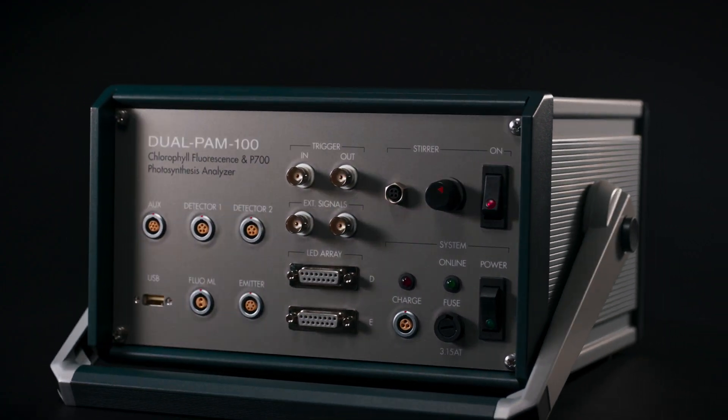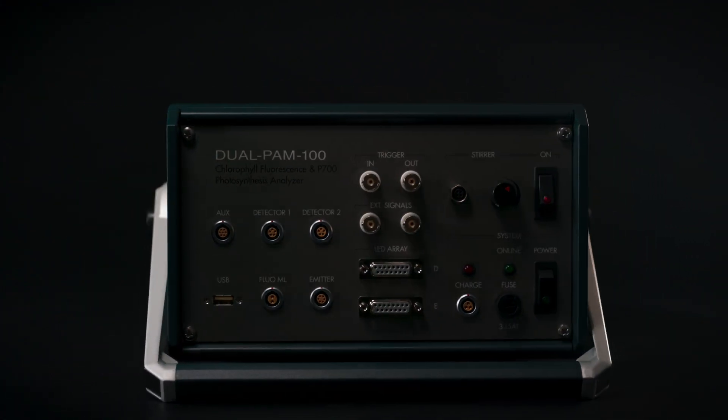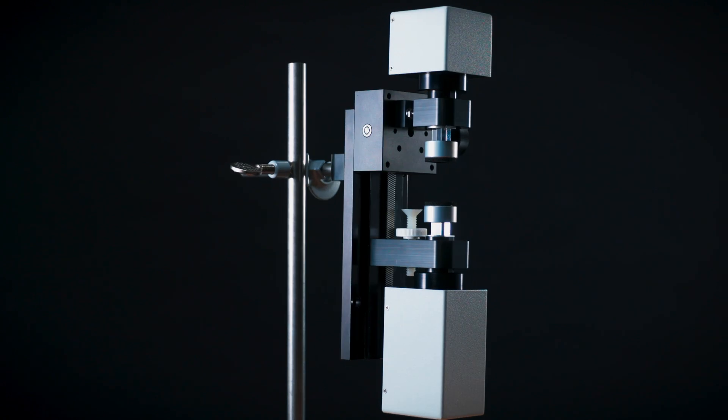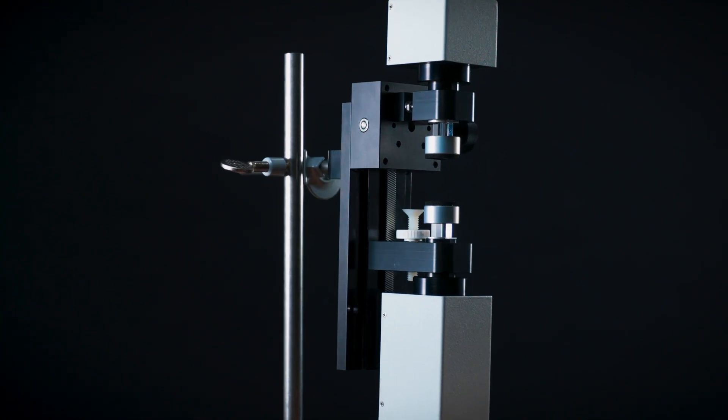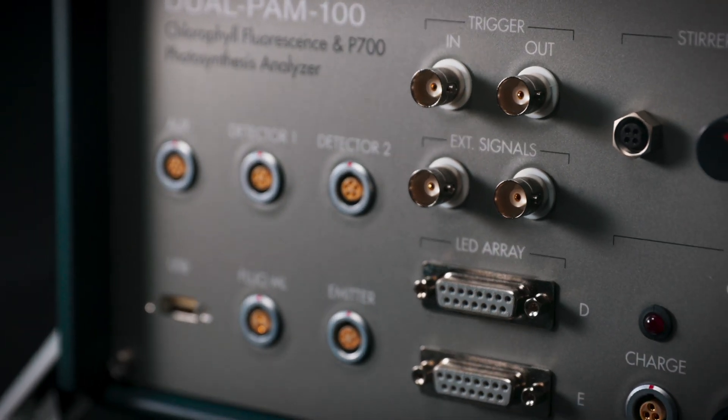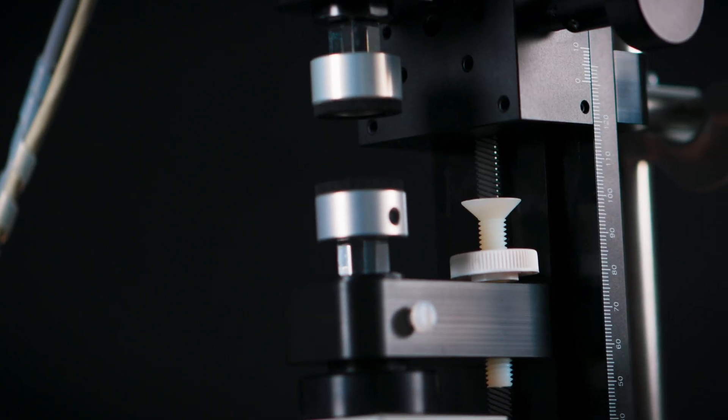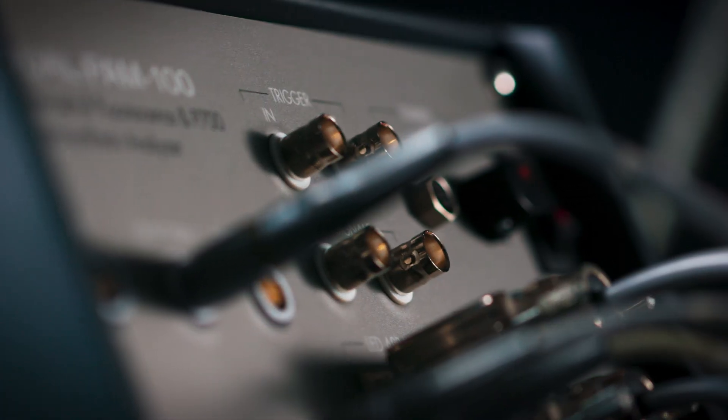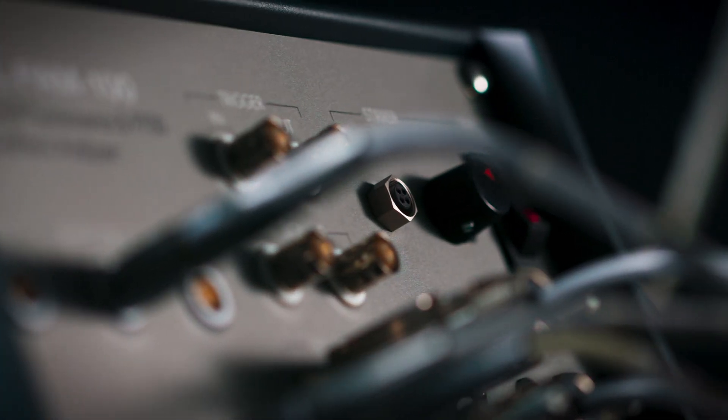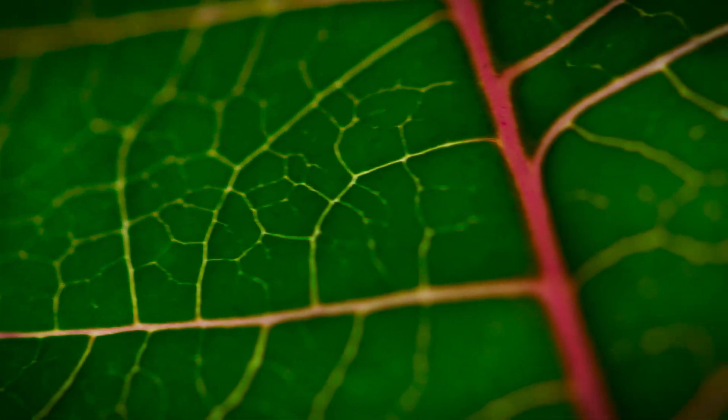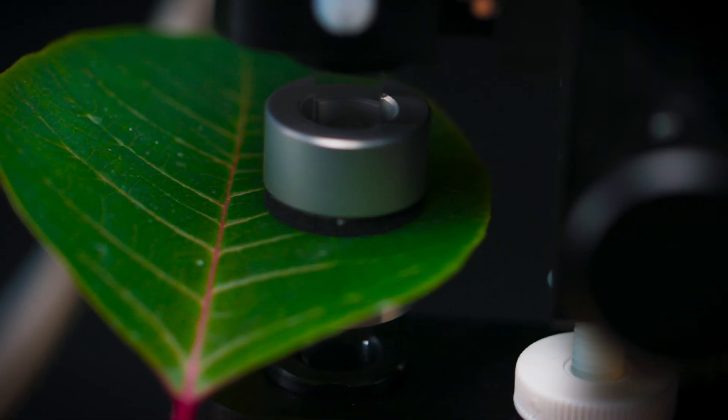Dual PAM systems excel by their capacity to analyze Photosystem I and Photosystem II simultaneously. This allows Dual PAM systems to gain insight into how the two photosystems work together in steady state, during acclimation, and under stress.